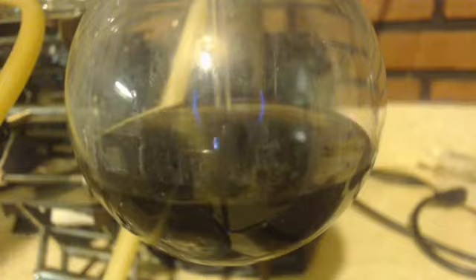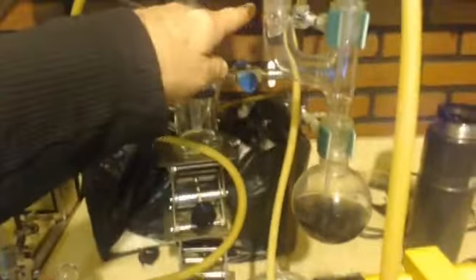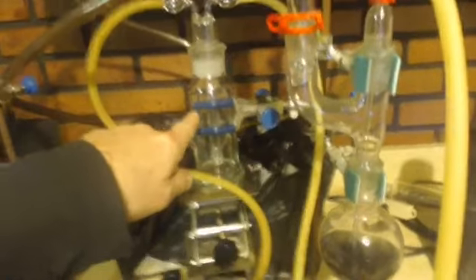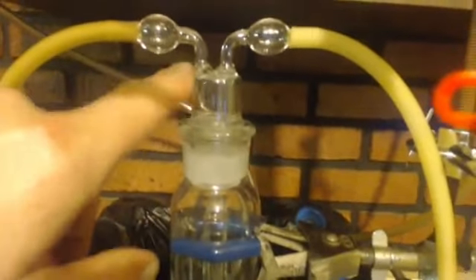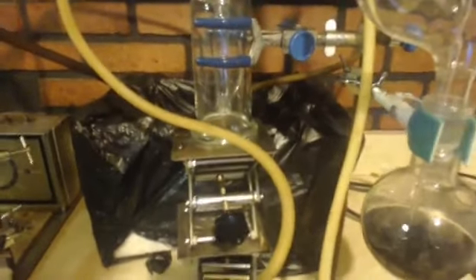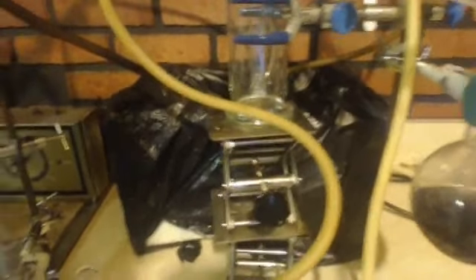it stops bubbling. It comes out of here. It's up here, down here, and it goes into here. So if it gets a suck back effect, there's nothing in there. Okay, it's an empty jar. It'll get sucked into here, and it can't go back into here because there's no tube. So it'll be stuck here, and that way it won't be destroyed by going into something like that or going into the actual pot.